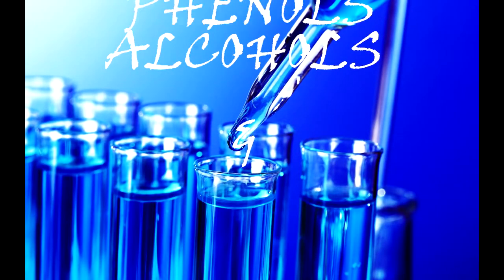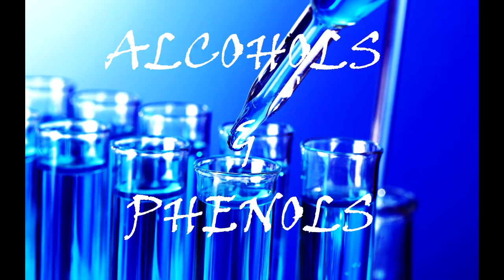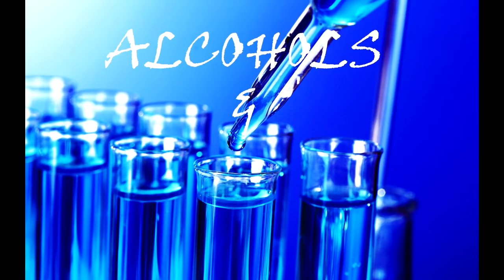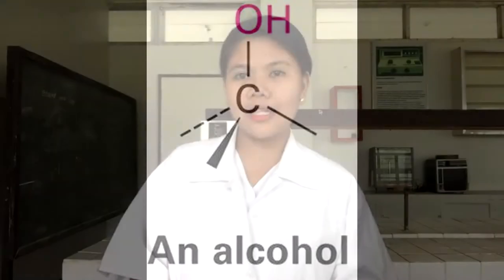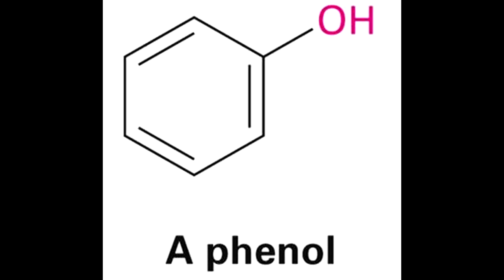Today's video, we'll be tackling alcohols and phenols. Alcohols are organic molecules that contain a hydroxyl group. Meanwhile, phenols are organic molecules that also contain an OH group, which is directly attached to a benzene ring.